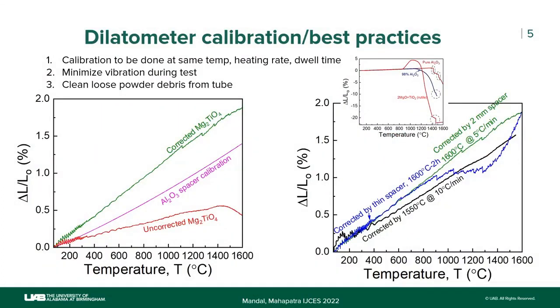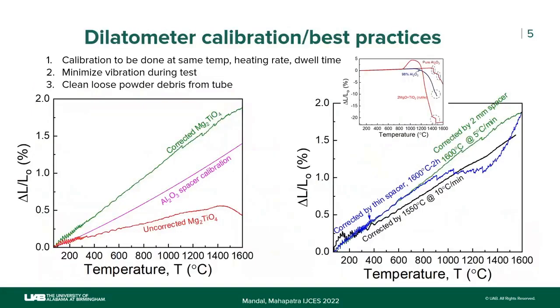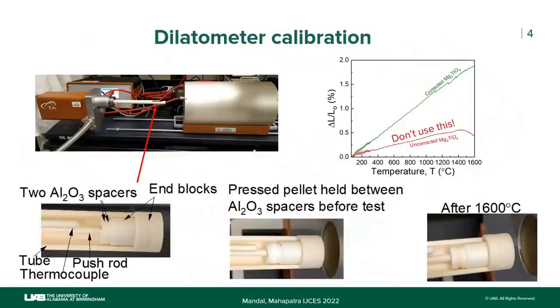This is all due to sticking samples or vibration, so you will know that your sample is reacting with your spacer. It does not affect the sample, because most of these tests I run, since I'm a PhD student, need to be repeatable. That's what my advisor wants. So I have done each test 2 or 3 times, and I see that it is repeatable. Again, you can buy these spacers. They are not very expensive, and we used to buy 50 spacers at a time and then run a lot of tests.